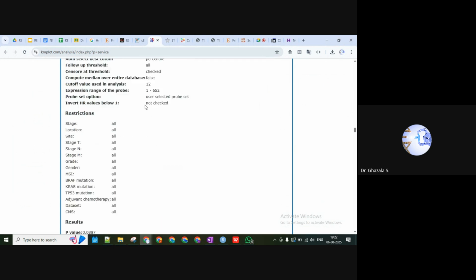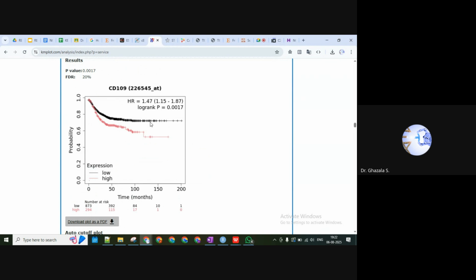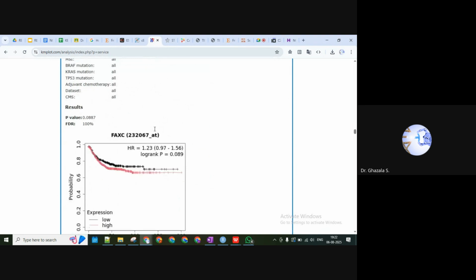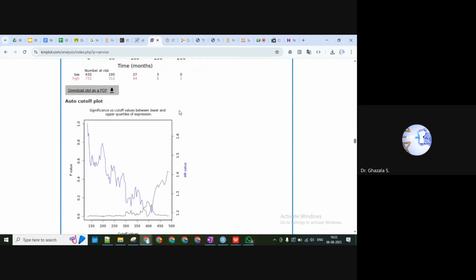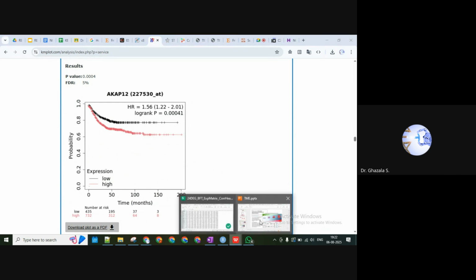Did you filter the predictive genes out of this? Because I can see not many genes are predictive. We have only a few genes here, maybe three or five. Those genes we can further proceed with to check how they are involved in the tumor microenvironment. For studying the tumor microenvironment, first we need to understand what the tumor microenvironment is. Let me discuss that first.